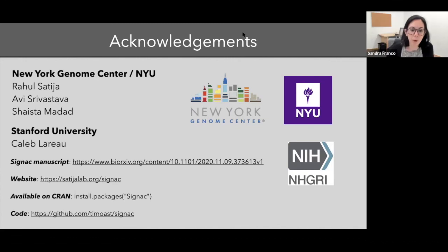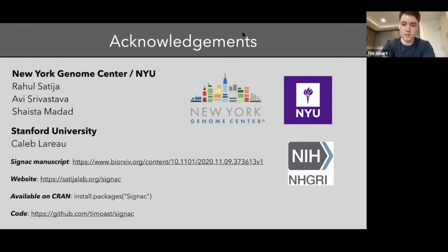Will Signac work similarly for the 10x Genomics single-cell multi-omic ATAC plus gene expression kit dataset? Because it seems that the ones you presented are using kits for single-cell RNA-seq and single-cell ATAC-seq separately. Yeah, so actually the data set that I showed for most of the talk was the multi-omic, having gene expression and accessibility in the same cell. So yeah, you can certainly use it for that.